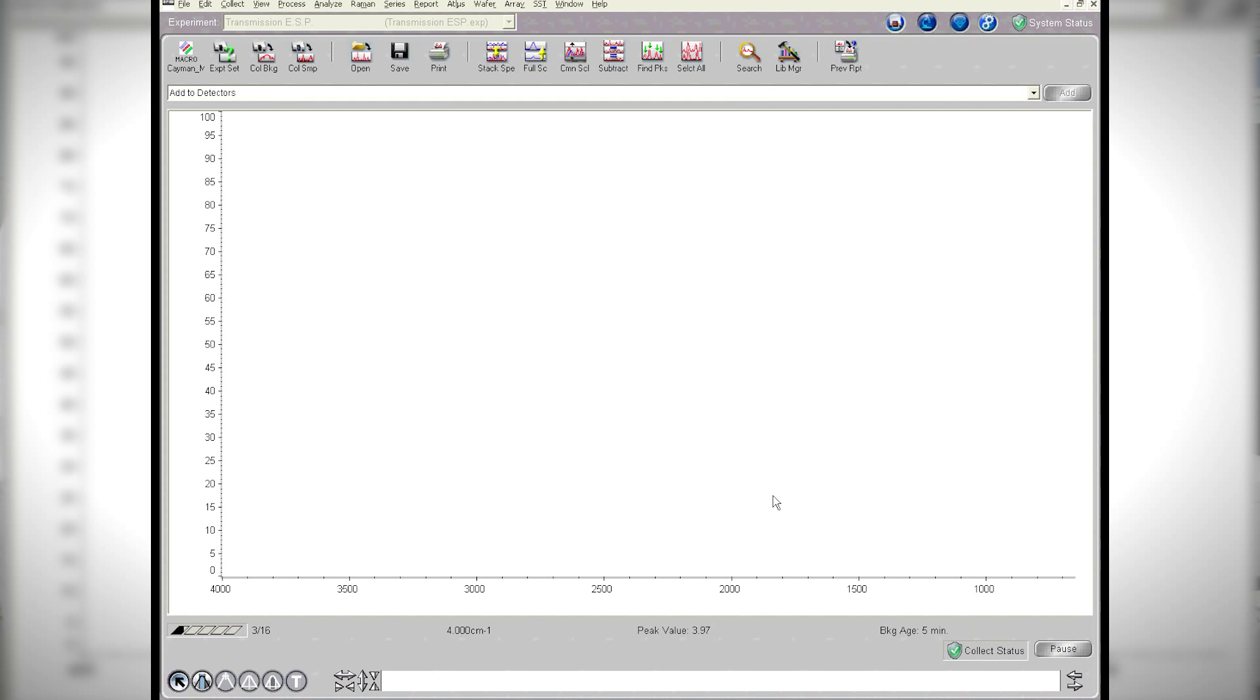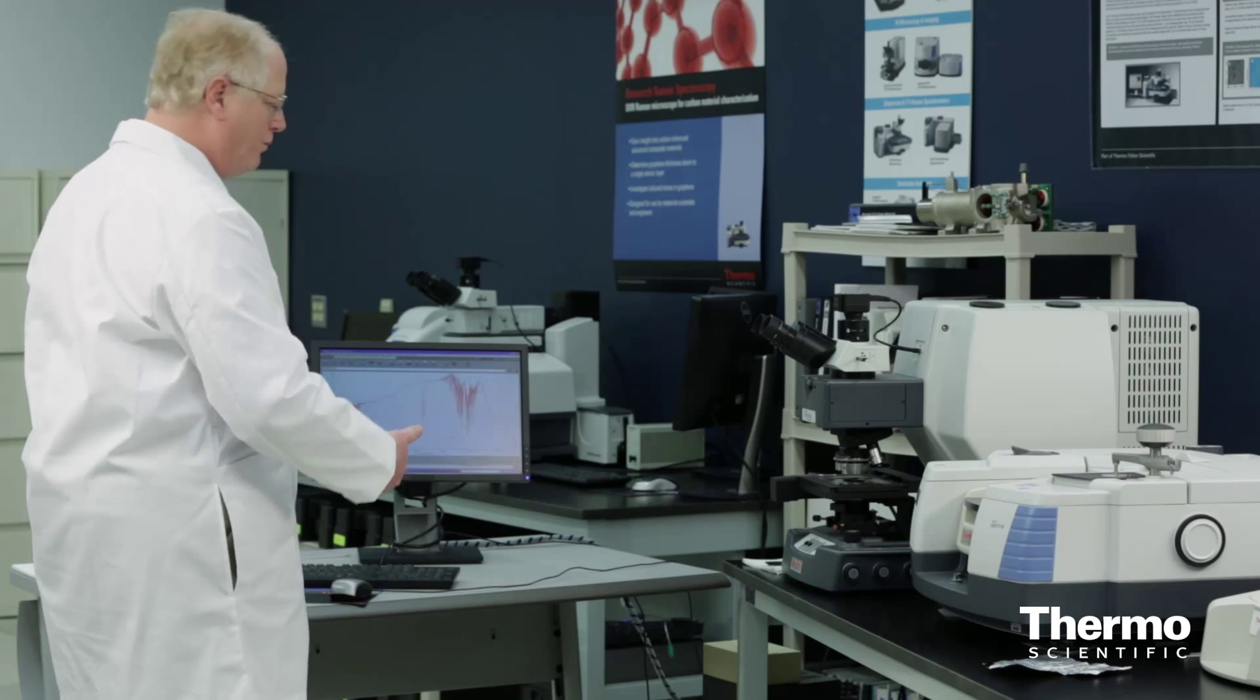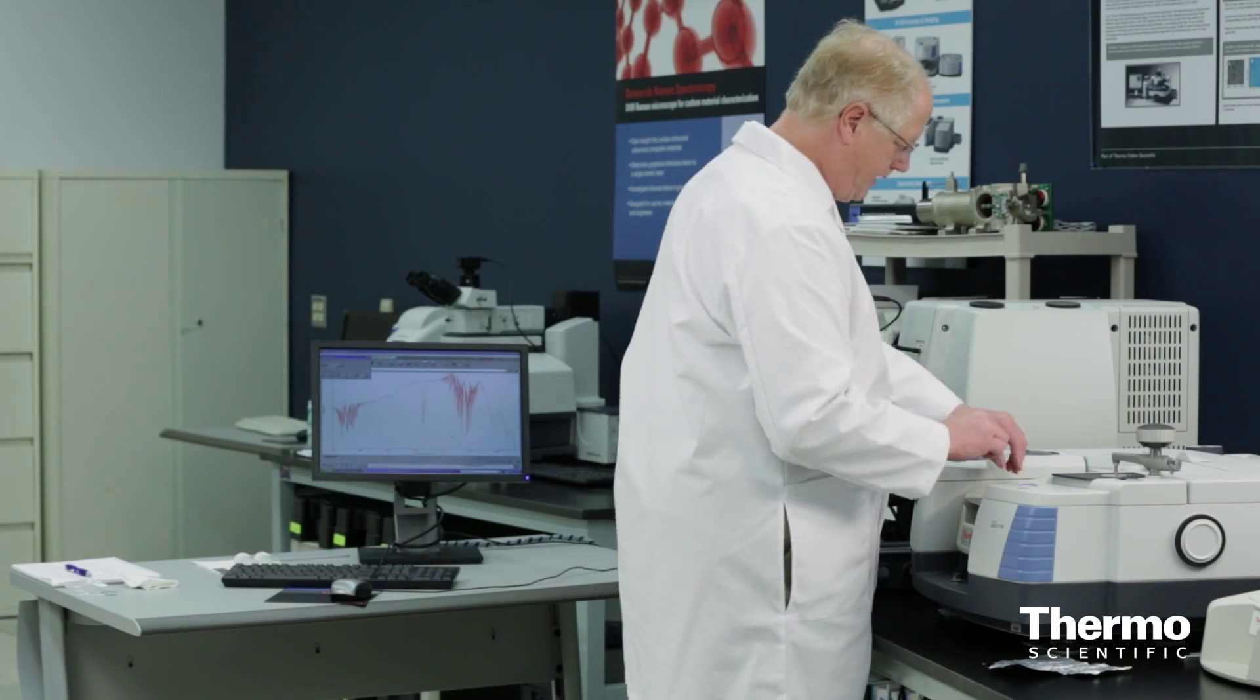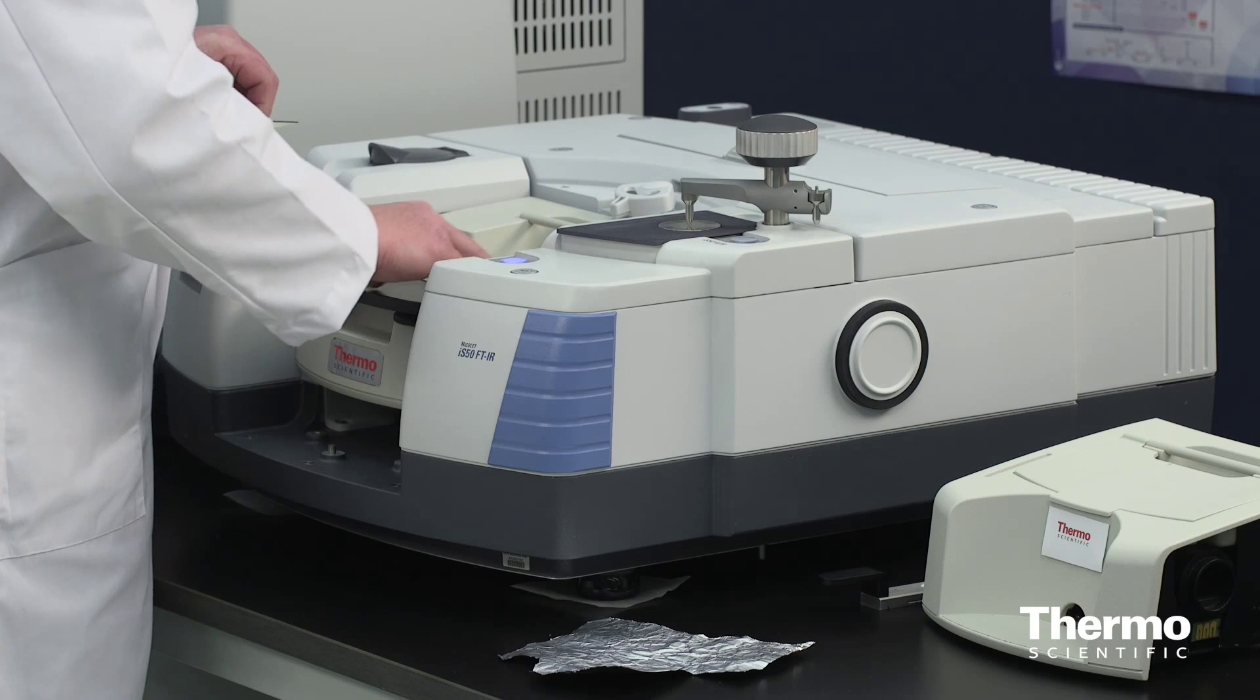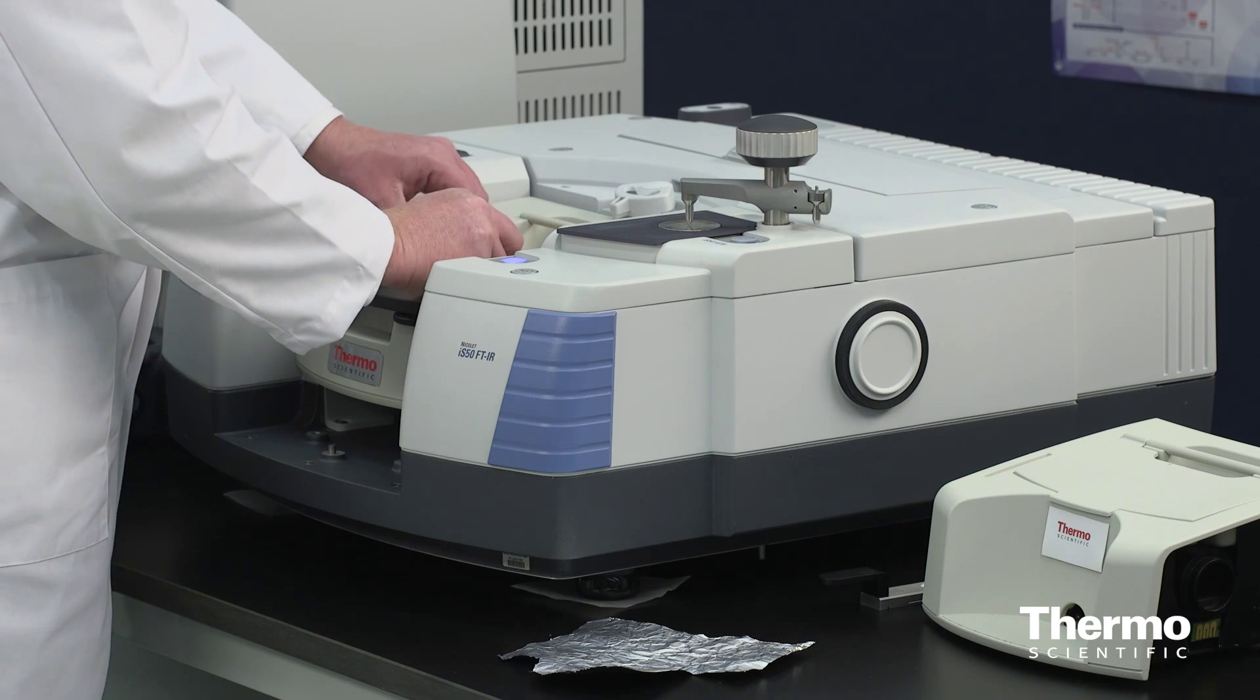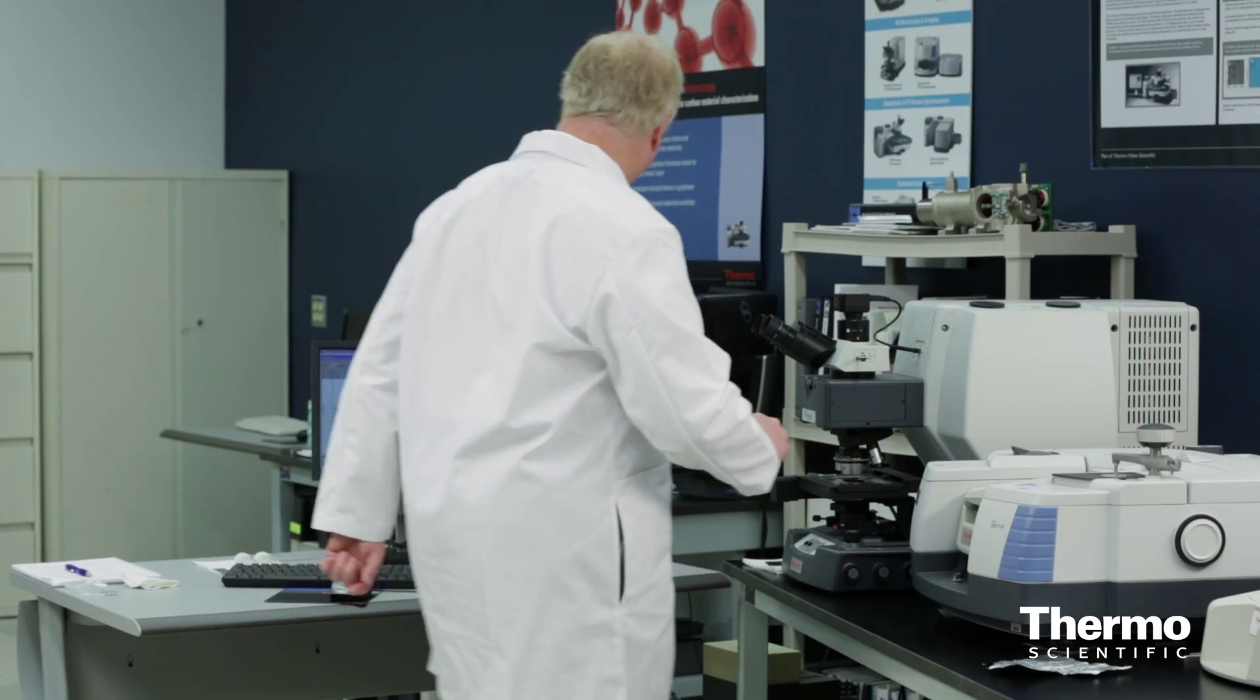This is the background being collected off of the uncoated side of the aluminum foil. And then we'll flip the foil over. Now it's completed that task, so I'll turn over my foil, lay it down and once again weight it down so that it's nice and flat across that surface.